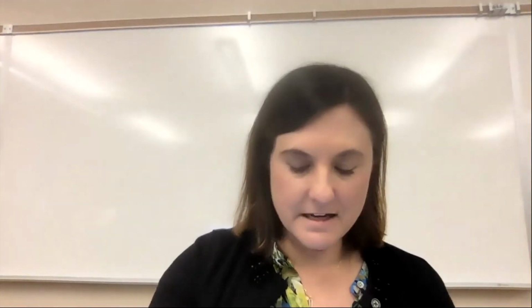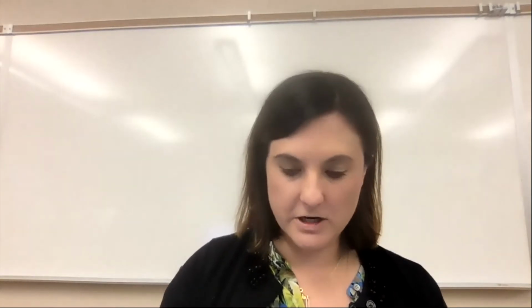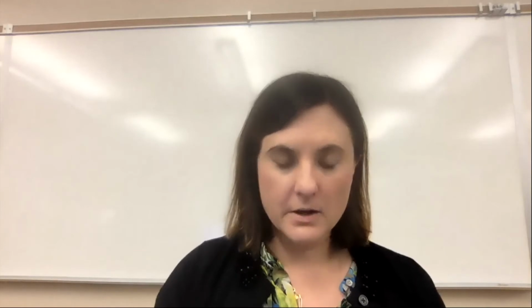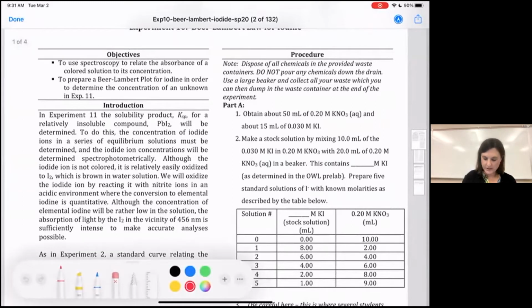That is going to be your first part, making a stock solution, and you need to know the concentration of that stock solution. Before you come to class, and you should do this on OWL, you need to calculate that. Let me show you where this is in the lab. Here's experiment 10. These are the ones I was showing you. These are what you were mixing. You're putting them in beakers that you label.